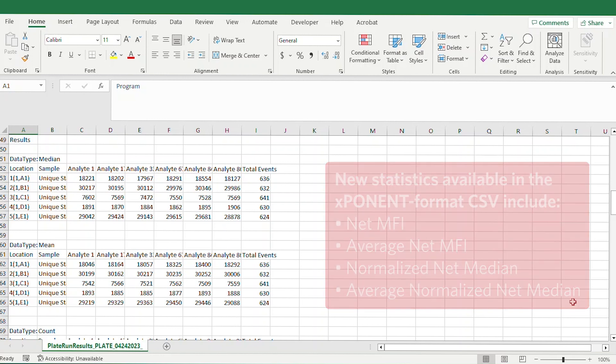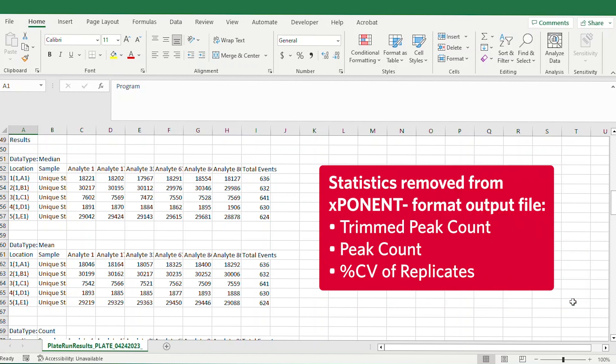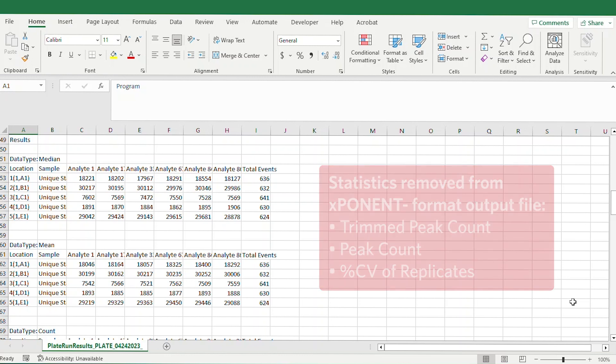For compatibility purposes, some statistics which were not present in outputs from the legacy exponent application have been removed from the exponent format output file. These include Trimmed Peak Count, Peak Count, and Percent CV of Replicates.